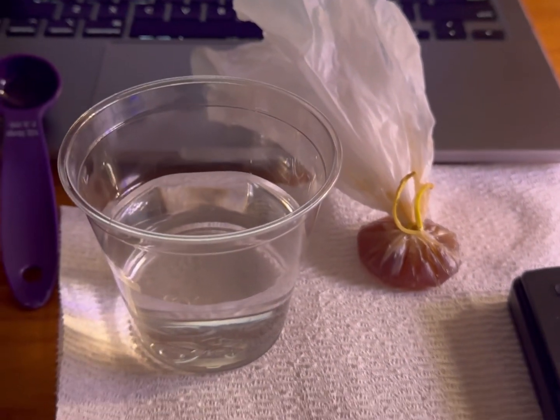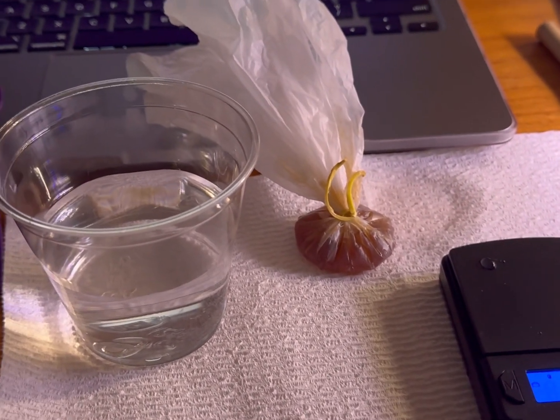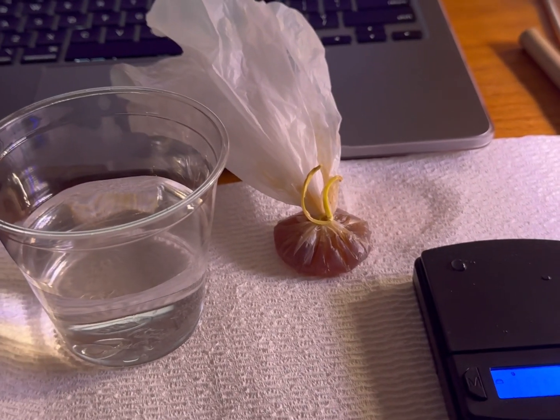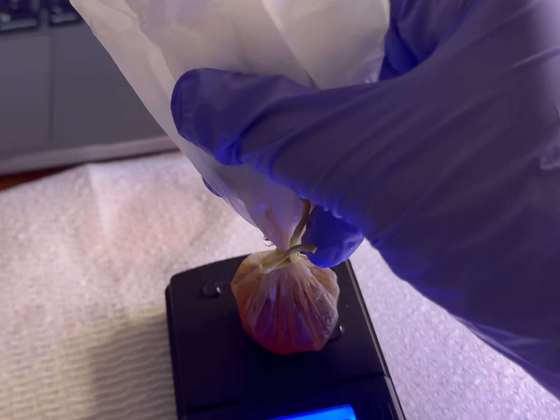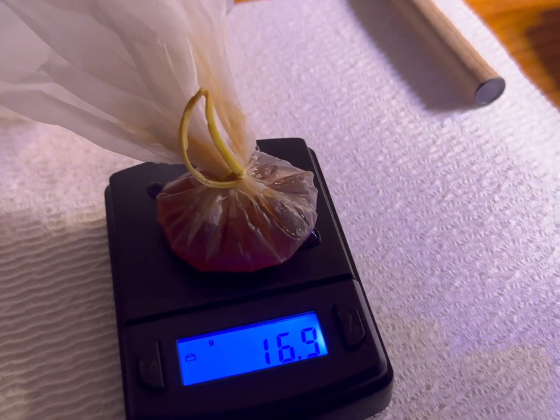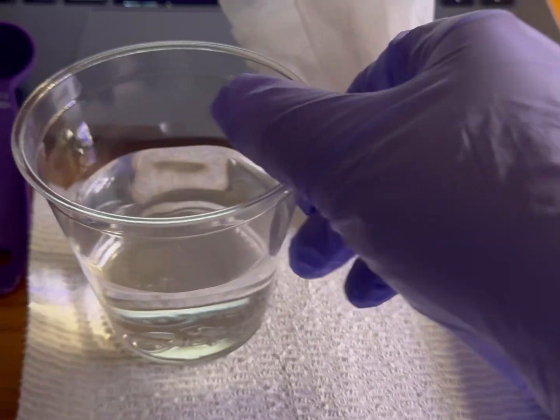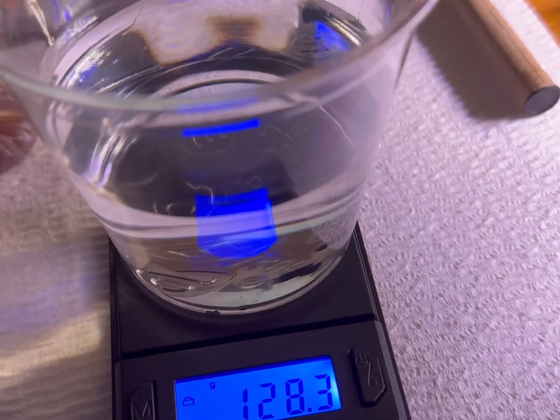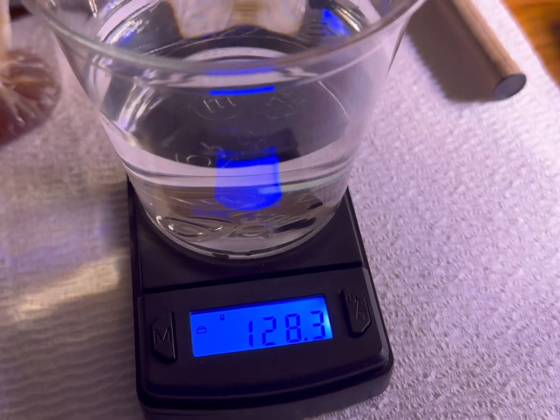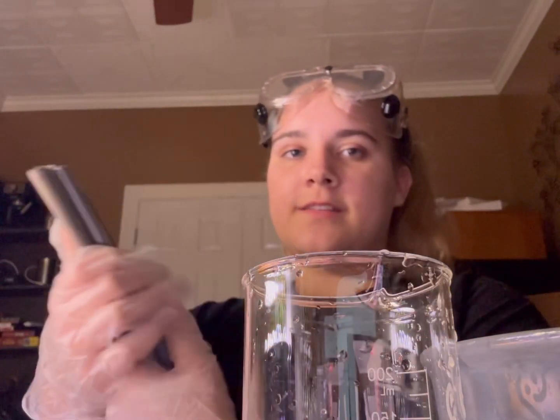So now we'll move back to exercise 1, osmosis, and we'll be weighing each of these to see if there's a change. So we'll see if the syrup has increased in weight any more. So it has, to 16.9 grams. And now the distilled water. It has decreased to 128.3. So I will write these two down. So here are my results for the first exercise.